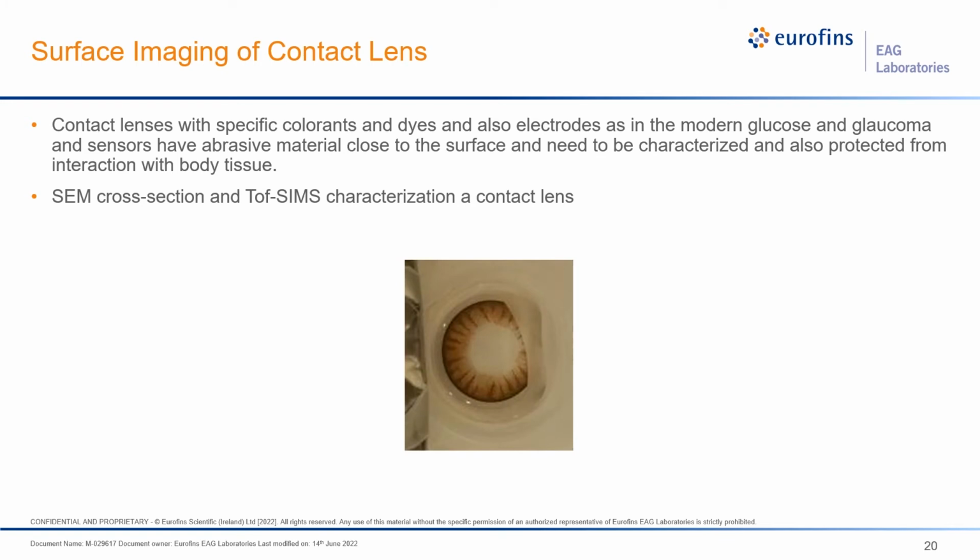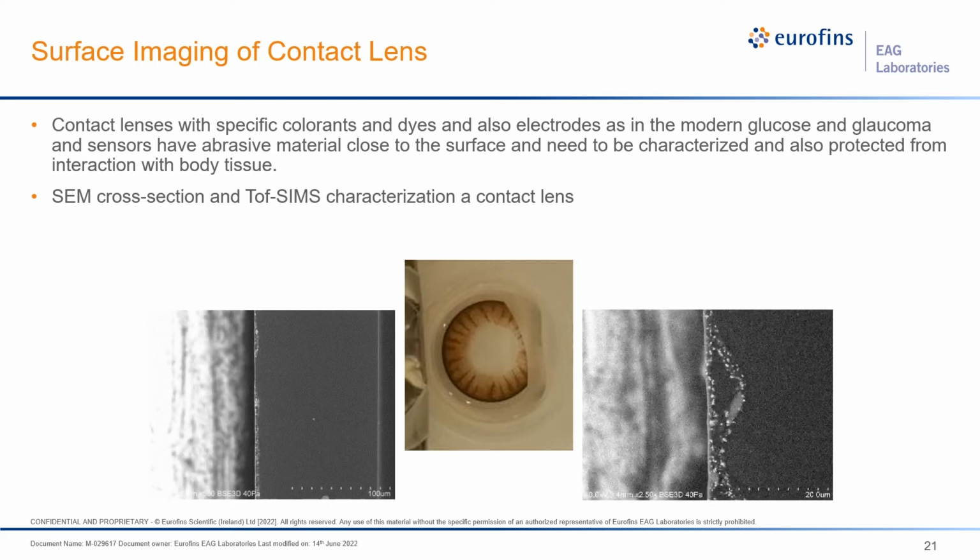So, as a worst-case scenario, we used an over-the-counter contact lens that are used for Halloween and have colorants and dyes. A cross-section of this lens shows that there are a large number of particles very close to the surface.